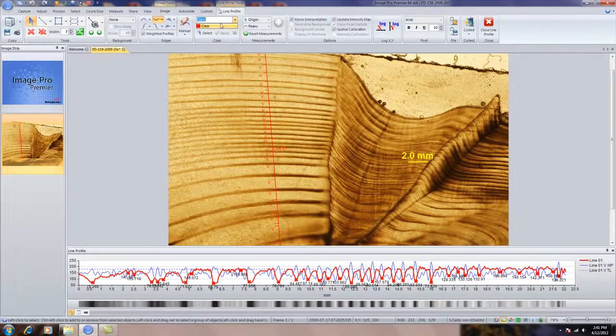And we'll have quite a number of labs that will actually name their edges and add those manually to the image. So if you'd like to add an edge, I can choose what type. I could add a valley. And if I need to add one here, now I'm just going to click on one. For example, I've done pretty well finding them all. I can simply highlight that, click on the image, and add it. You can see I've added one right there.